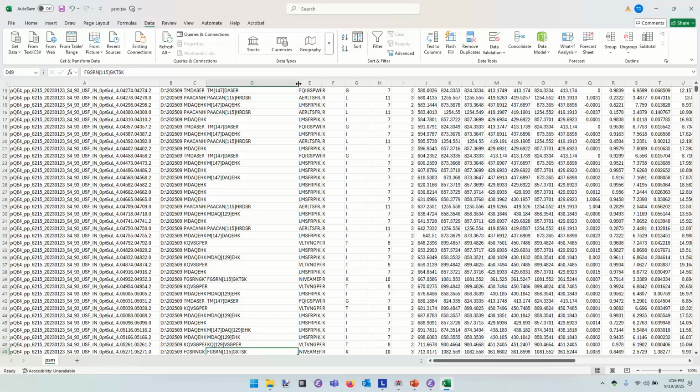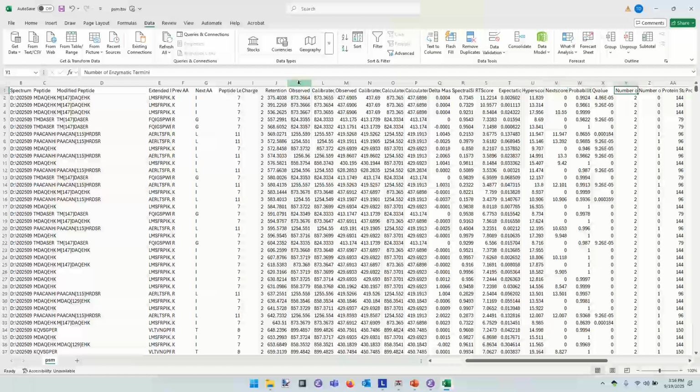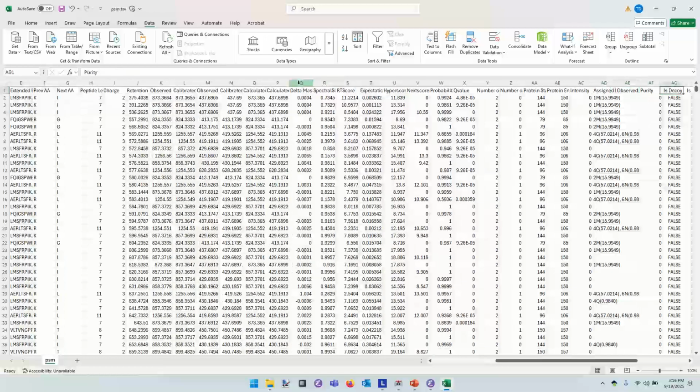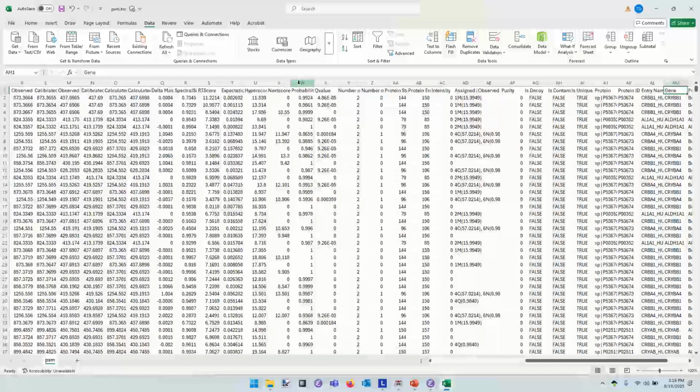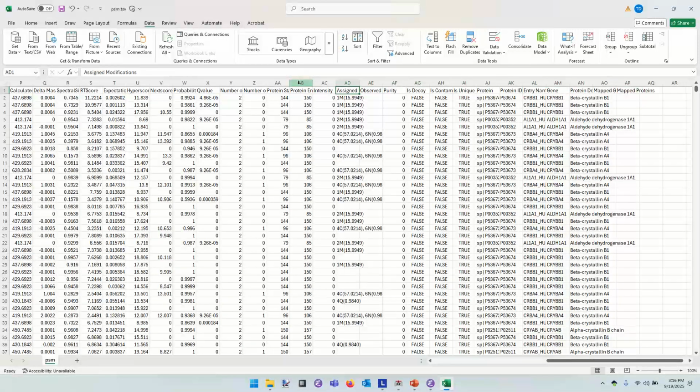But I wanted to find localization, so let's dig into that. Whew. This table goes on a bit, doesn't it? Yeah, so the localization is not really featured in this. One of the things you would be expected to do when you publish a paper claiming the recognition of some novel PTM is that you express your certainty in its localization.